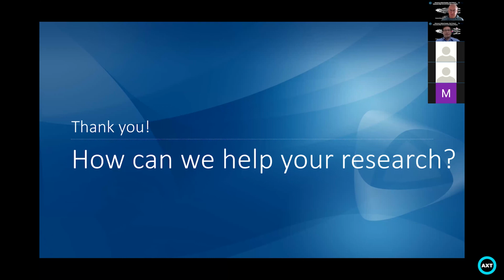But, yeah, Michael, it's Aaron here. It's a bugbear of mine, because there was a WMIC event a few weeks ago talking about best practices in COVID imaging, and it was purely PET centric, as you would expect, because PET's the standard everybody has. There was a passing reference to those couple of studies we highlighted, which are seen as the most advanced optical imaging studies. They're not that different, as you say, from immuno-oncology or any other oncology studies, where you're just looking at rough patches of bioluminescence: it's there, not there, big, small, growing, shrinking.